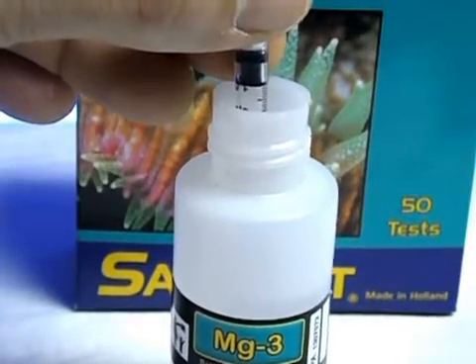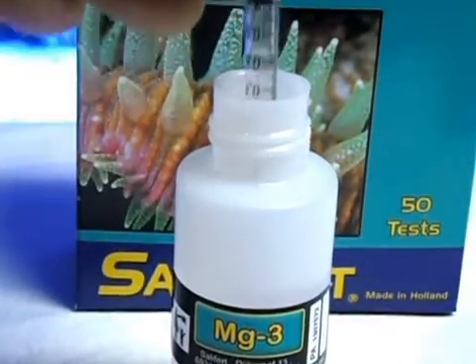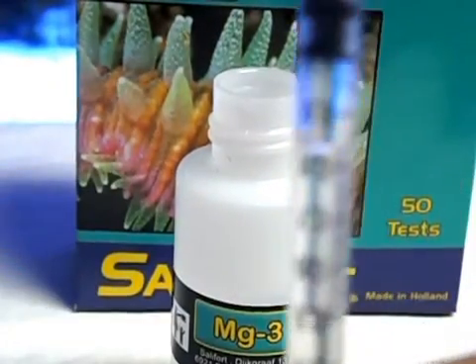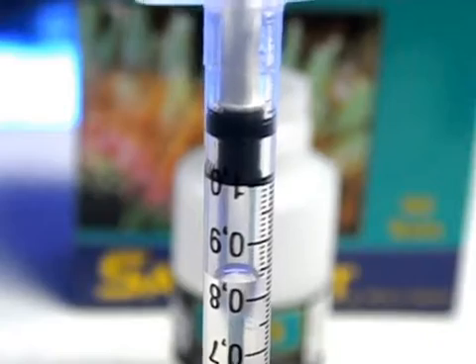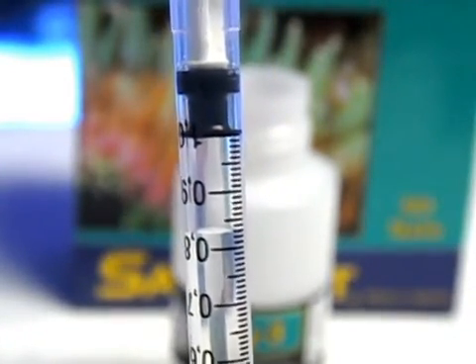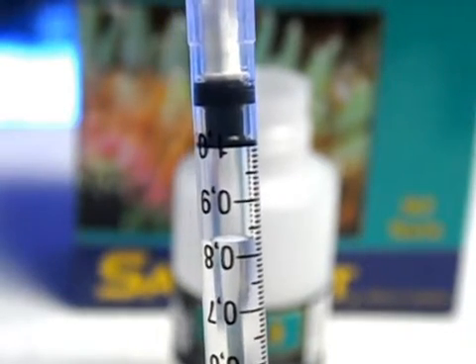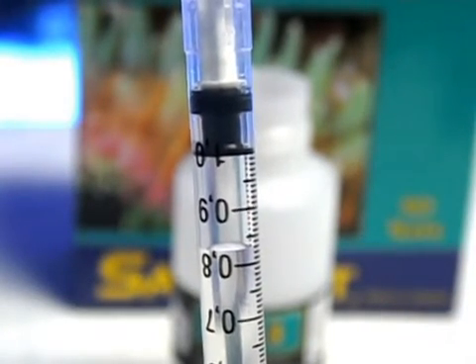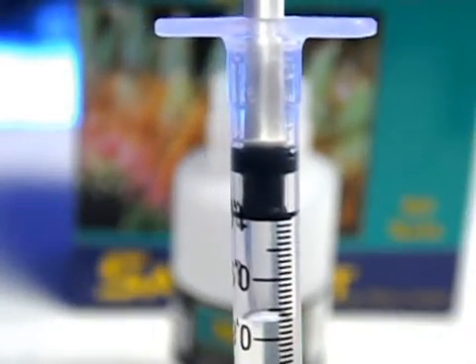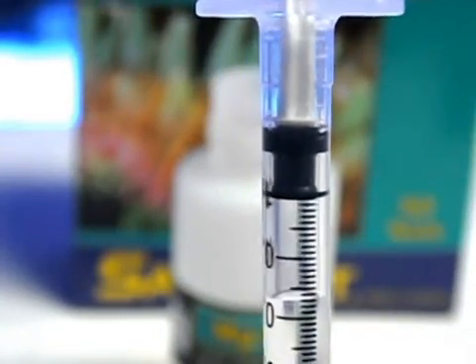The next step is to draw magnesium three into the one milliliter syringe until the black part of the syringe lines up with the one milliliter mark. Don't worry about the air gap because that doesn't affect the test results. As long as that bottom black part of the syringe lines up with the one mark, you're all set.